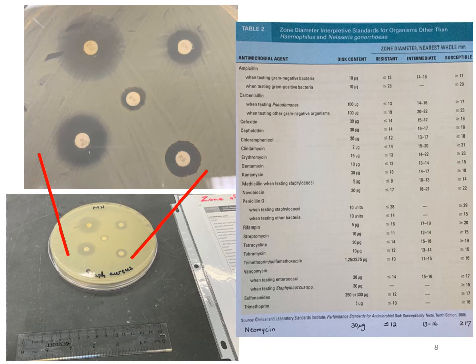Now this is just to show you how in the lab setting, once you have your plate with the different zones of inhibition, you would use one of these little rulers and you would count the millimeters. So make note that the millimeters are the little small lines on this side here. So that 1 is actually a centimeter. So that would be 10 millimeters, 20 millimeters, and so forth. So what you would do is you would take the diameter. So you could draw a line from here all the way across to here, and you would measure that line as the diameter.